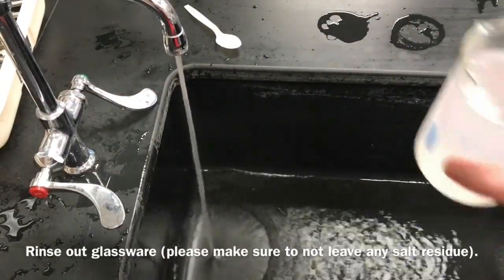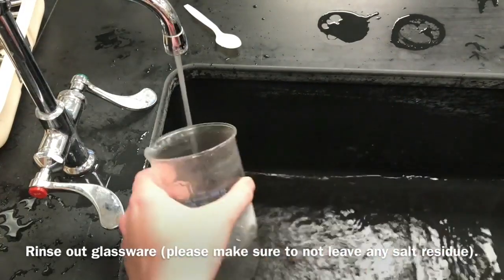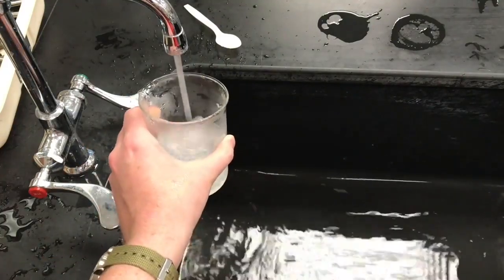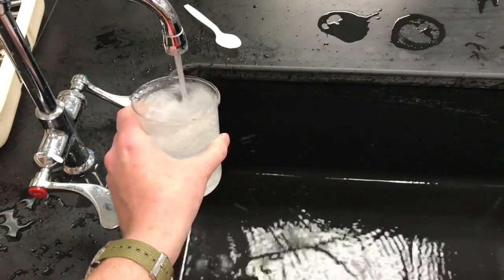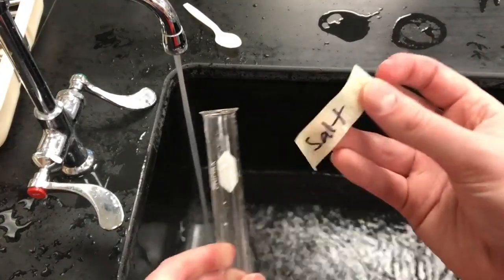All right, so our beaker here, you're going to want to rinse this out quite a few times. I would say 5 times. Same thing with our test tubes. Take off the tape, please.